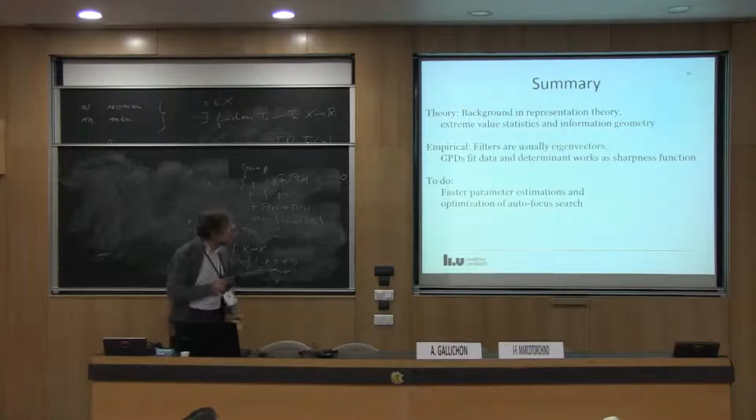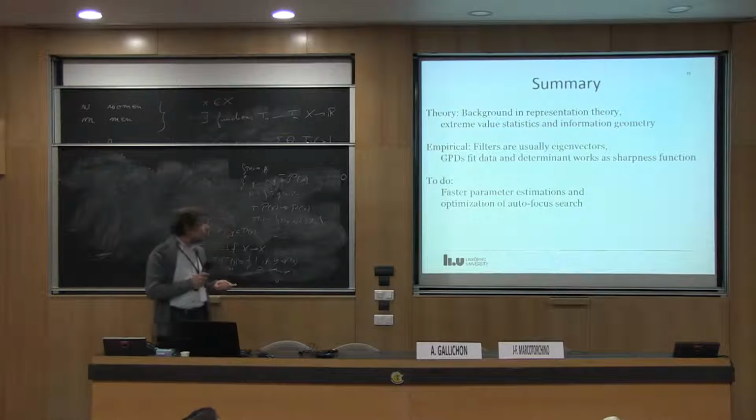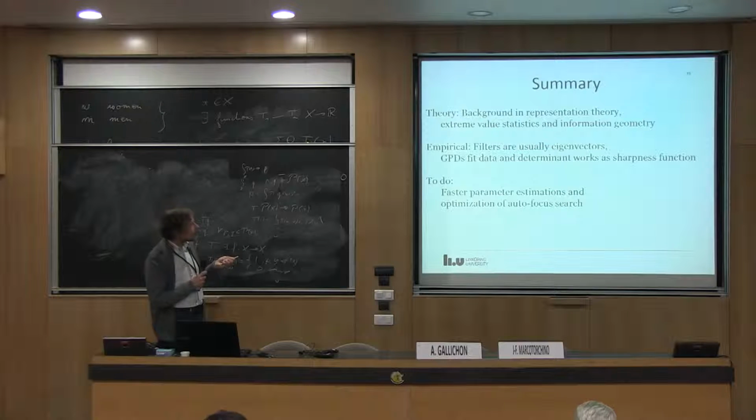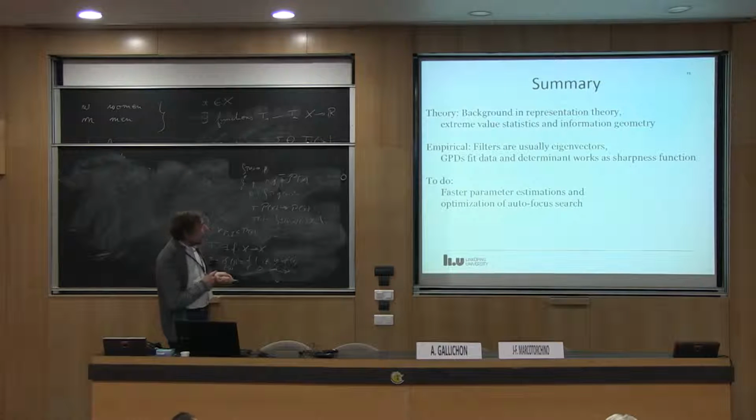So conclusion, the filtering has a background in representation theory. The statistics come in the maximum selection here, and extreme value statistics is applicable. And then the curve in the manifold can be analyzed with information geometry.